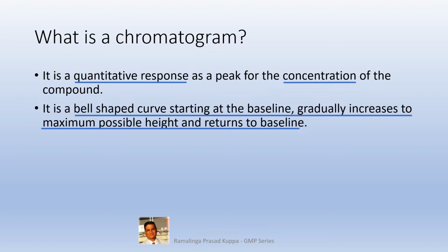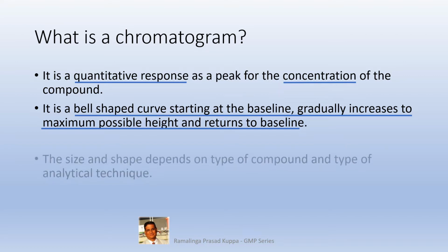When the separated component enters the detector, the baseline slowly starts rising and reaches a maximum height depending upon the concentration. Then it slowly and gradually drops down as the concentration decreases and reaches baseline again.